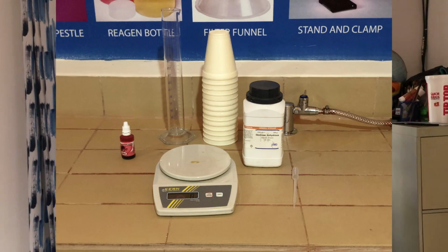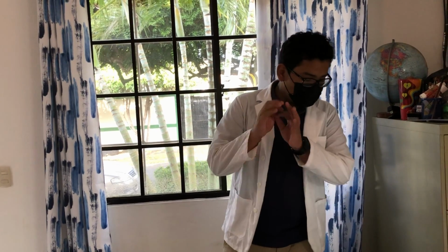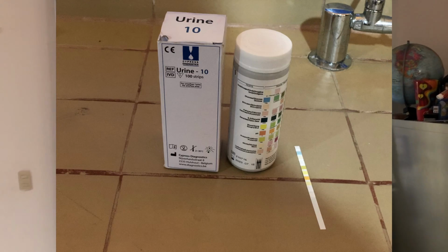So the materials that we plan to use are the following. We need one graduated cylinder that is able to hold 100 milliliters of water. We need one small bag of glucose powder. We need 30 grams of it. We also need urinalysis test strips, 8 plus 3 for each food you plan to test.